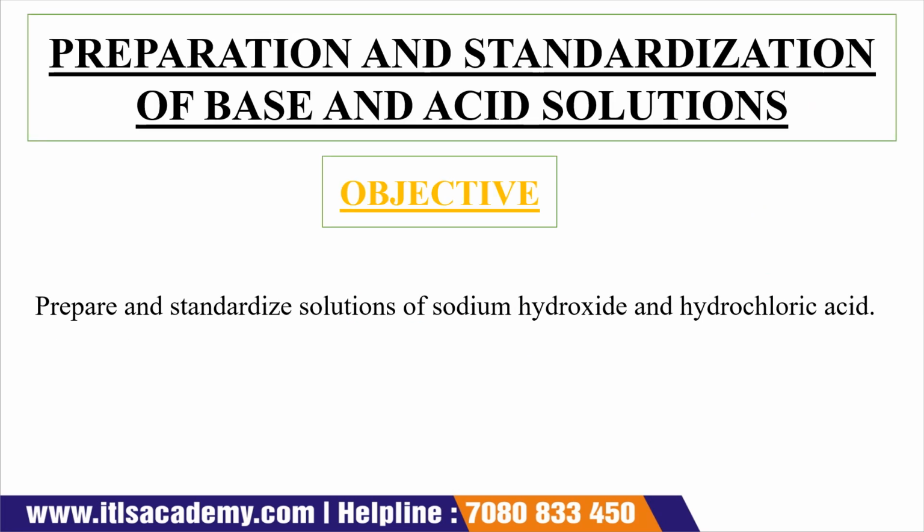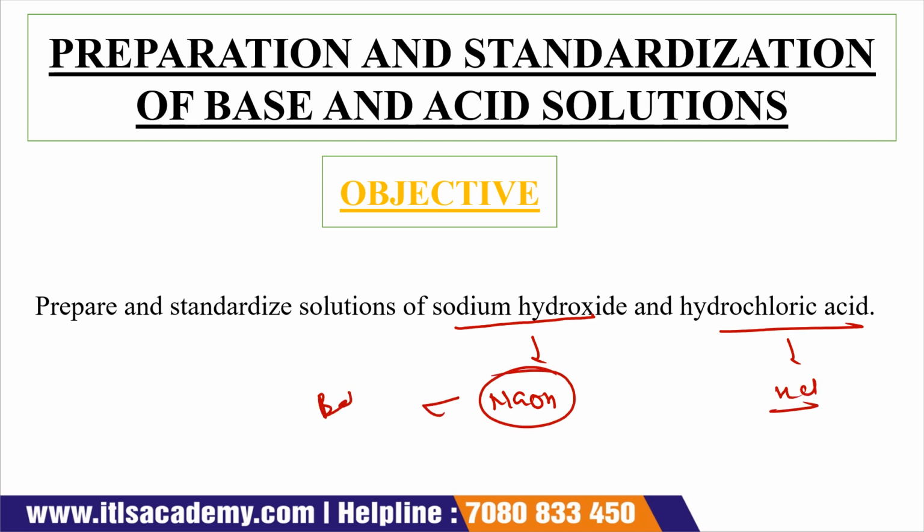Now the next one is your objective. The first one is the preparation and standardization of base and acid solution. In this we are going to see how we prepare sodium hydroxide solution and hydrochloric acid solution, that is NaOH and HCl. This NaOH is a common base, and this HCl is a common acid.